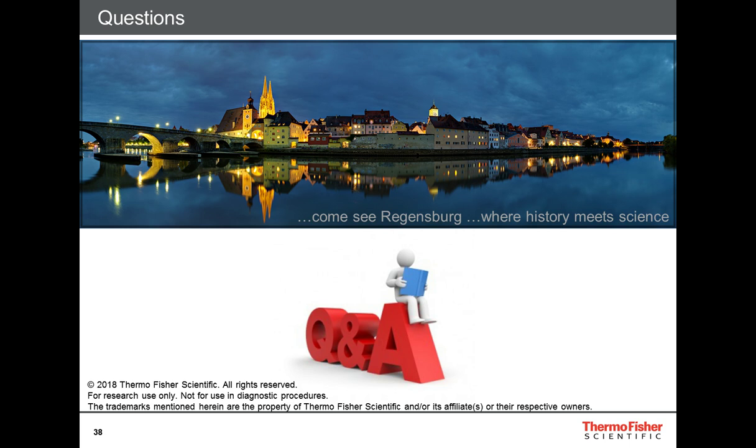Okay, thank you. The next one is, when should somebody prefer insect cell expression over mammalian cell expression? That's a good question. I can't give you a good answer to that because I personally haven't worked with insect cells before. From what I know, though, some proteins express extremely well in insect cells. And of course, the nice thing is that if you choose the insect expression system, then the first thing that you do is you generate virus, baculovirus, and with that you infect the cell.